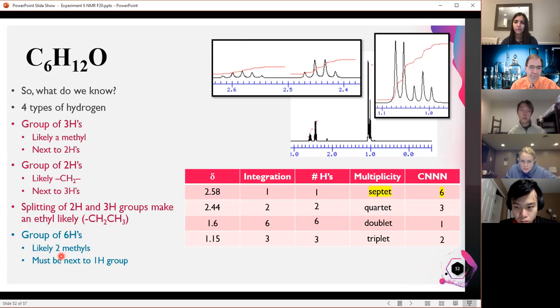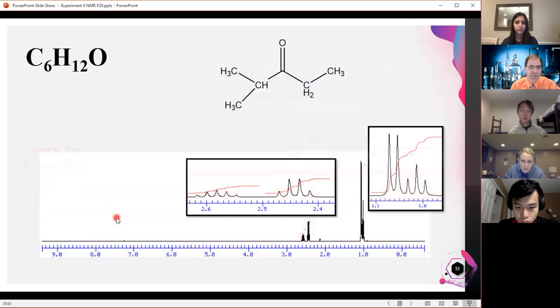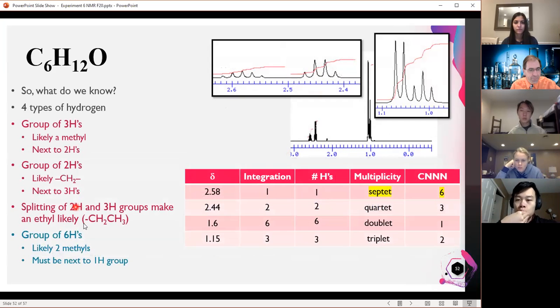So how does that help me? Okay. Well, you see, we got pieces, but we don't just have pieces, we have connections between the pieces. All right, so let's look at it here. Here's what I'm going to propose. Now, let me come back for a second. Actually, I jumped ahead. The other thing is I've highlighted this in red and this in blue because these 2 groups cannot be directly next to each other.